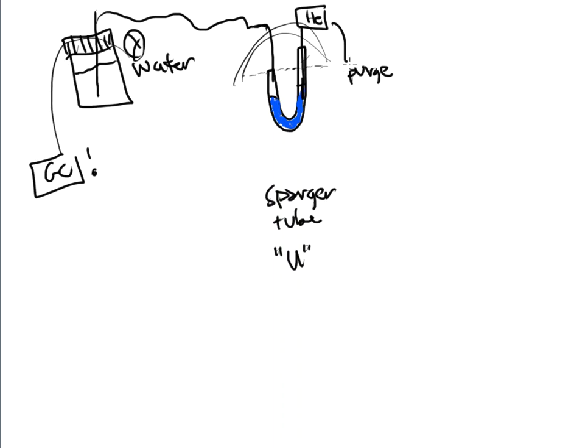So we have helium that goes into this U-tube shape, and that helium is getting pumped through the sample. And this is bubble, bubble, bubble. All of those helium bubbles are traveling through this sample, and what it's doing is that it's beginning to push out all of the volatile chemicals on one end of the U-tube. Everything's getting bullied, and it's getting bullied by the helium. Well, this kind of happens naturally in a way.